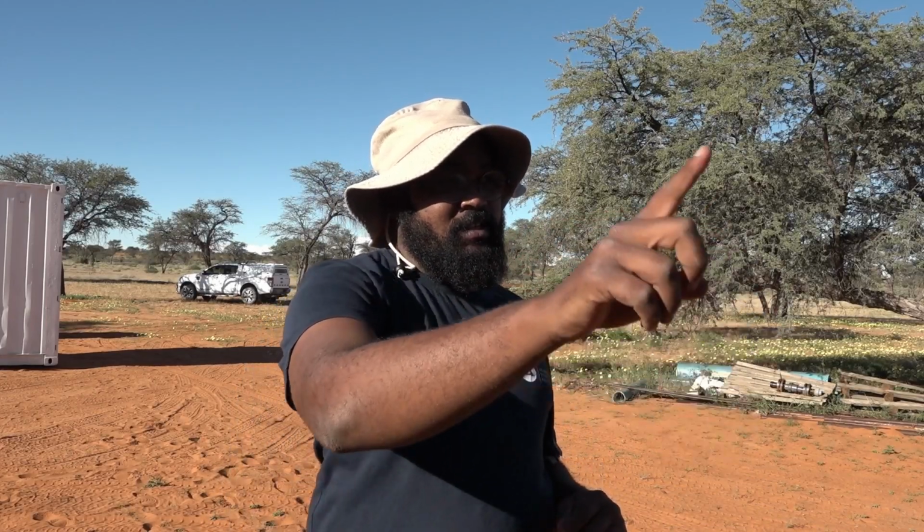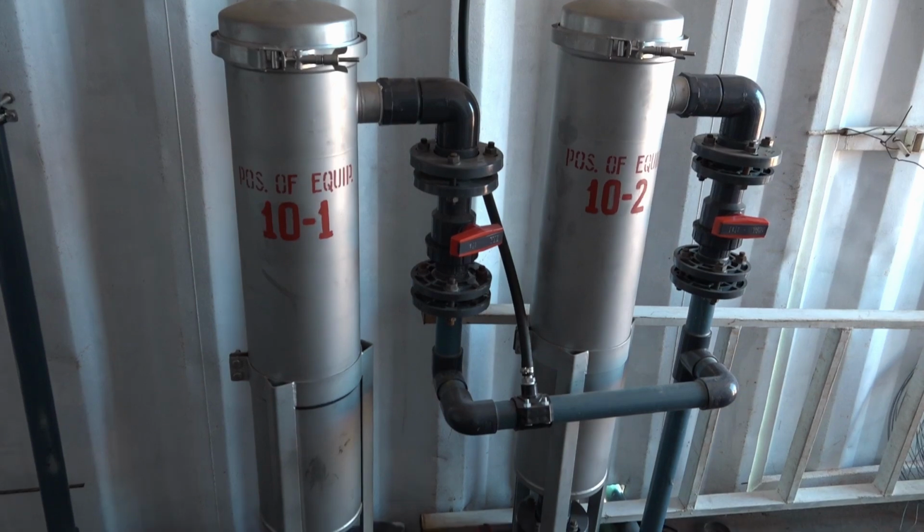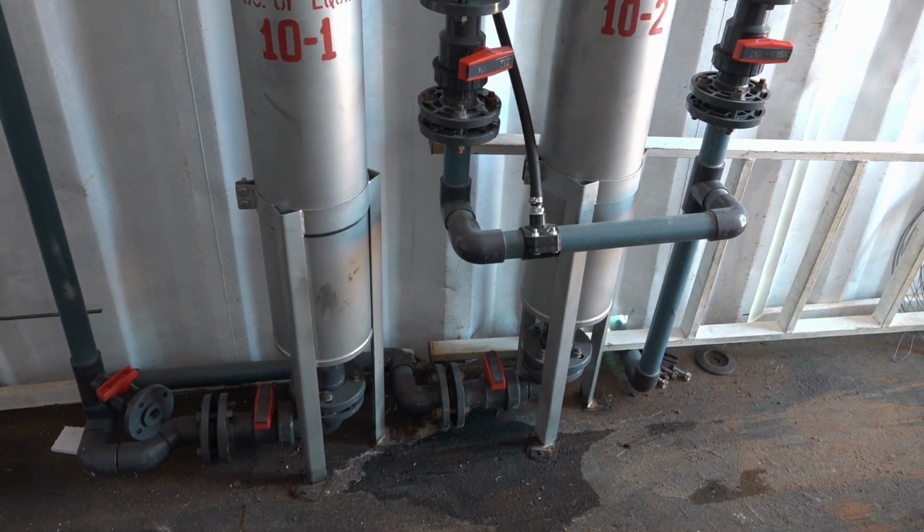Once we finish taking out the uranium, we need to start rehabilitating the aquifer back to how we found it. So already you can have all your units taken to another place, and you start there fresh. So you are actually testing that water. So there will be water samples running in between the lab and this area while we're doing the test. And then also to understand the uranium content in the pregnant solutions and all that. We'll be doing those tests here.